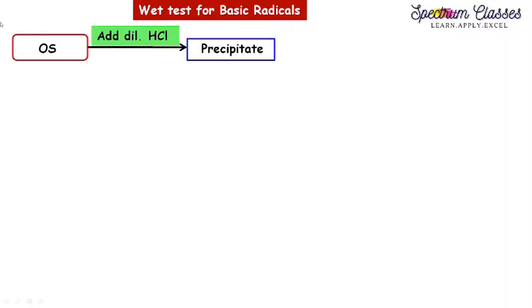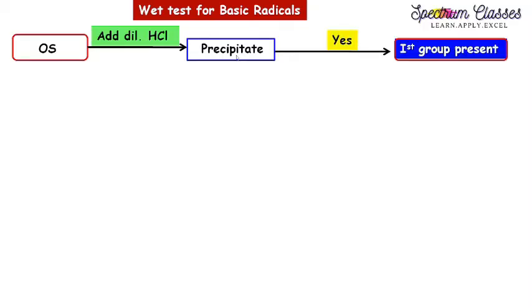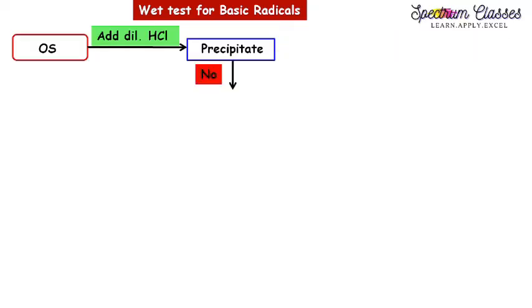Now I am showing you the wet test for basic radicals using this original solution. For acidic radicals we prepared the water extract and sodium carbonate extract, but for basic radicals we prepare the original solution. To this original solution, if prepared in water, we add dilute HCl — which is the group reagent for group 1. If you get a precipitate then it suggests group 1 is present; if no precipitate is observed, group 1 is absent.